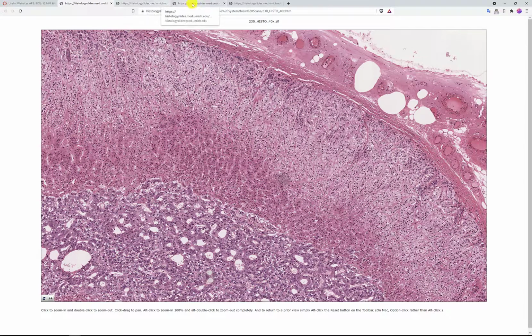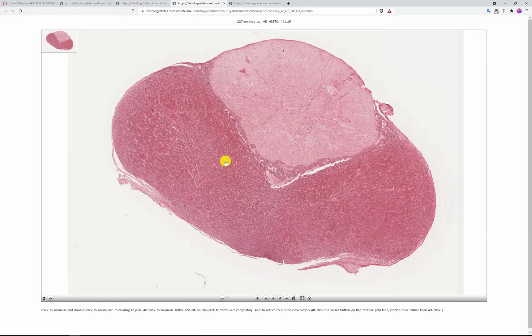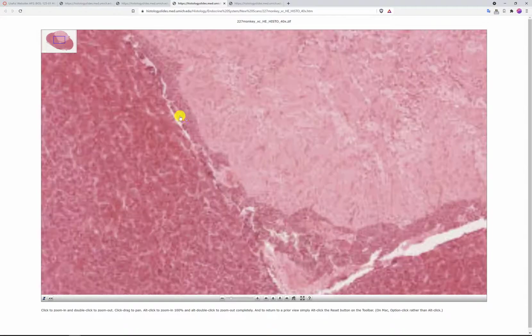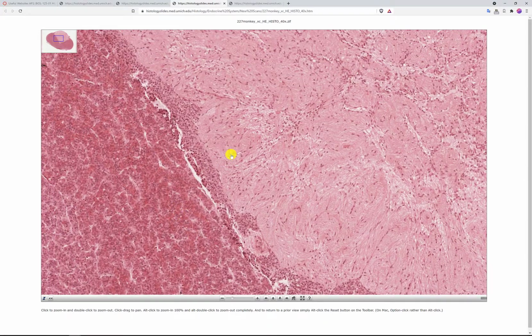and take that picture. If we move to the pituitary gland, if you remember, the pituitary gland also is made out of two things, anterior and posterior pituitary. And for the posterior pituitary, we said this is a neural tissue, so what we are looking at is axons, not cells. The glandular tissue was in the anterior pituitary. As you can see here on the low magnification, I clearly have two distinct regions. I will zoom into them and see what I'm going to find.